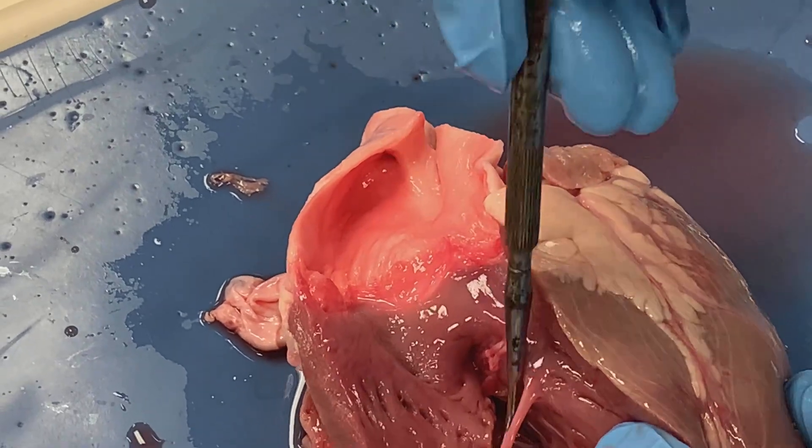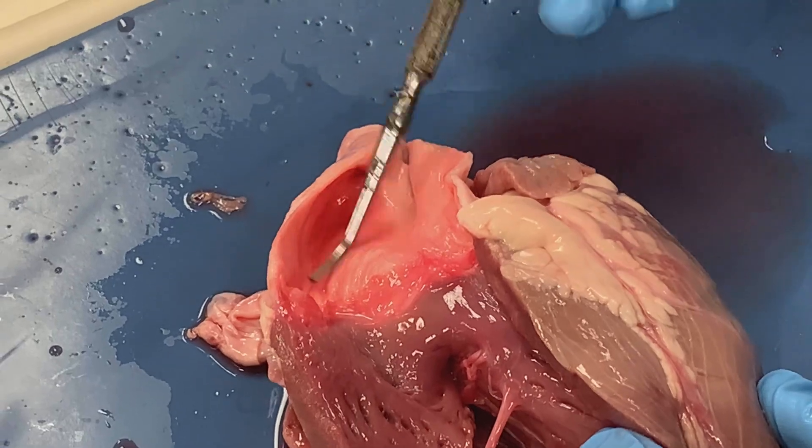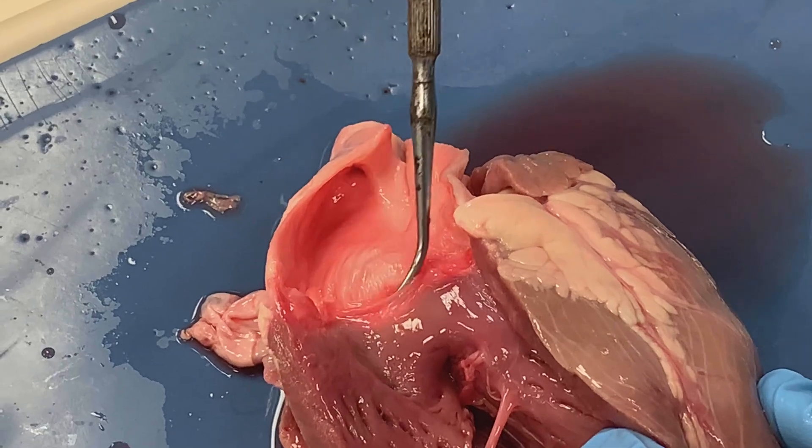You can think of these as two separate rooms. So we have a ventricle as one room, our pulmonary trunk is another room. Separating those rooms we're going to have a door, or another valve.